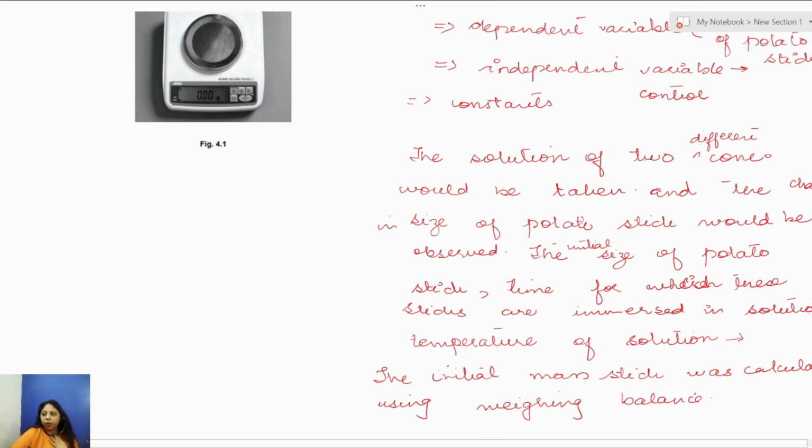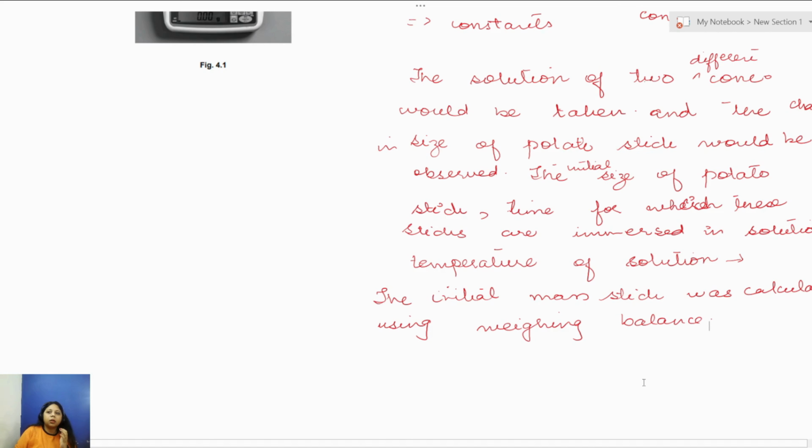This is for P4. When you have to design the experiment, you have to learn what things are required. They are not many, almost 10 or 12. You can learn those.